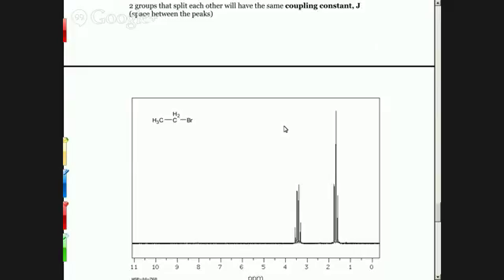All right, so that gives us a spectrum like this. We get two signals from the NMR, one here and one here. Now, obviously there's some more going on here because those signals are split into further little peaks, and they're pretty separate from each other. So we've talked about a couple things to understand that and what that means.